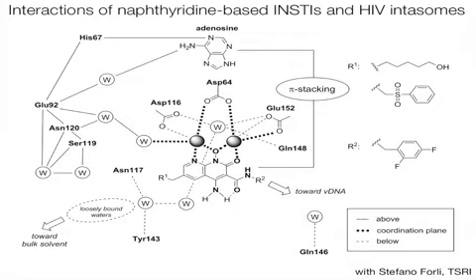The R1 group, that's the one that we're very interested in, and the group that we're actively modifying to elicit better binding and better response. It points toward the bulk solvent. What's important is that the positioning of its long chain displaces loosely bound waters. Now, I'm not showing the data here, but in addition to the structural interpretations, we actually have some MD data that confirms the water molecules in the bottom left region of the schematic are loosely bound. And displacement of these loosely bound solvent molecules should be entropically advantageous for the compounds.